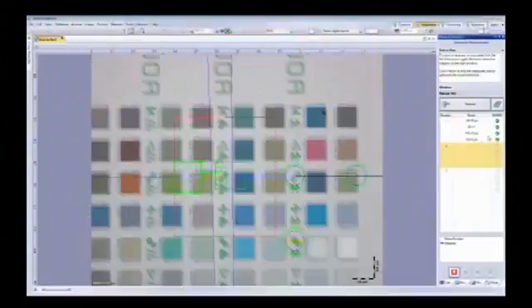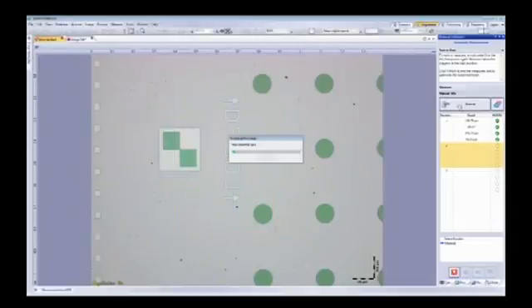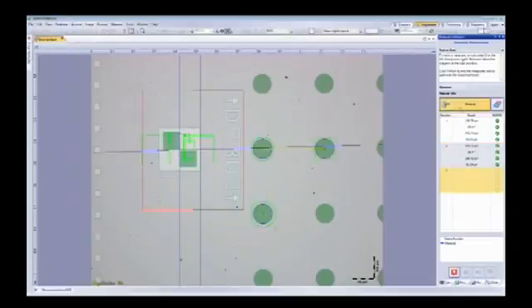Now they'll probably move to several new points on the sample, and you can see that this new point is close enough, it's within the field of view, the pattern's there. So it'll automatically find it. It's going to automatically find that pattern for us and mark all the measurements again. Show us the layer thickness measurement.